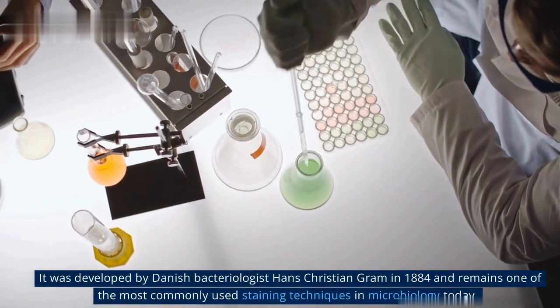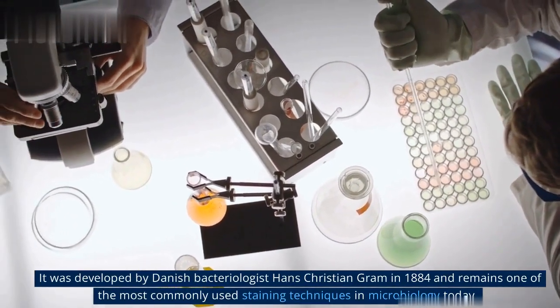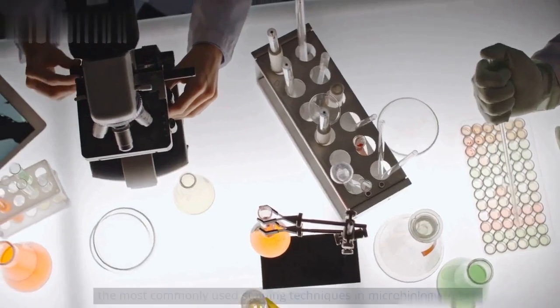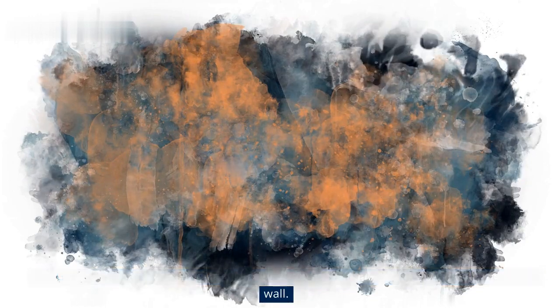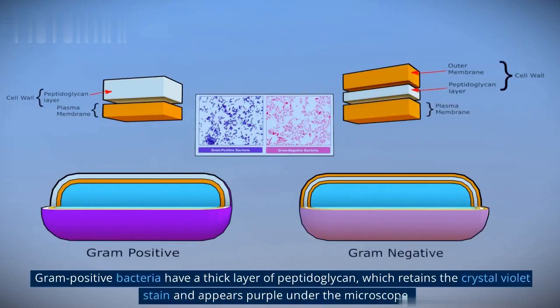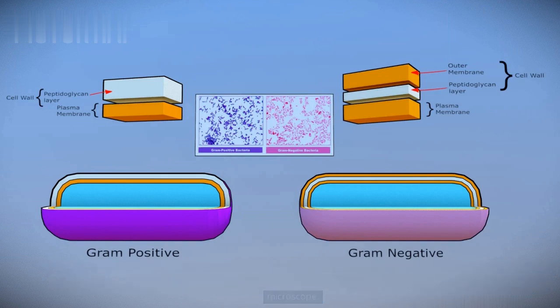It was developed by Danish bacteriologist Hans Christian Gram in 1884 and remains one of the most commonly used staining techniques in microbiology today. The gram stain works by using different types of dyes and alcohol to stain the bacterial cell wall. Gram-positive bacteria have a thick layer of peptidoglycan, which retains the crystal violet stain and appears purple under the microscope. Gram-negative bacteria have a thin layer of peptidoglycan and an outer membrane composed of lipopolysaccharides, which do not retain the crystal violet stain and instead take up the counterstain, safranin, and appear red under the microscope.